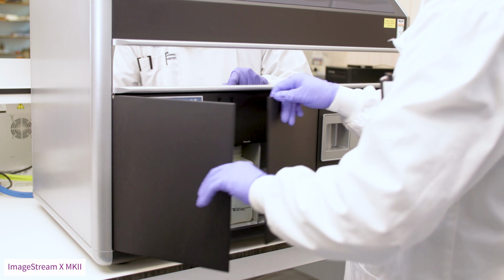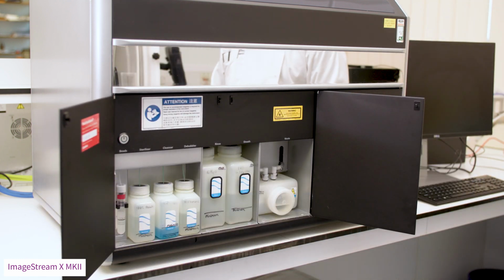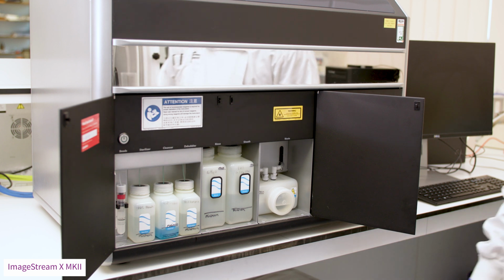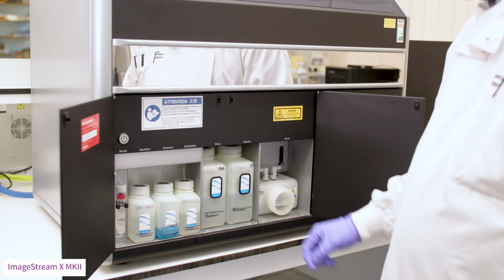To begin, check the levels of all the fluids in the machine. Empty the waste if necessary and fill all the reservoirs including the sheath, water, cleanser and steriliser, as well as the speed beads. We have indicated some suggested minimum and maximum amounts with black lines on this machine.